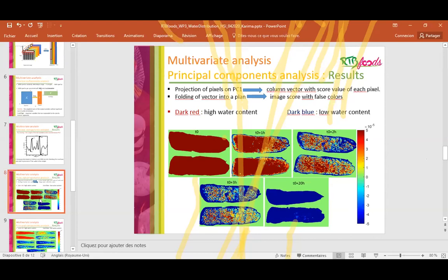No need to. It depends what you want to characterize. Here I want to characterize the distribution structure on the surface of the yam. I have to cut, but in other cases, maybe you don't need to.